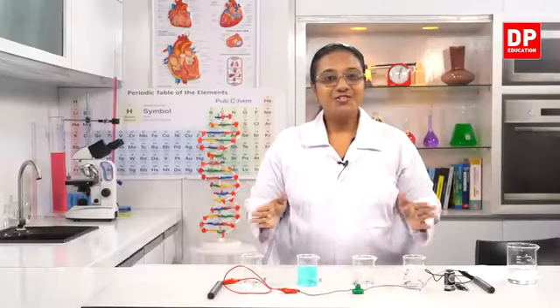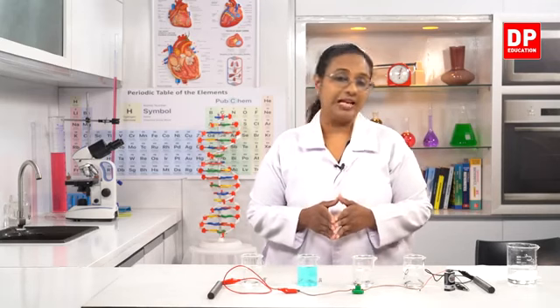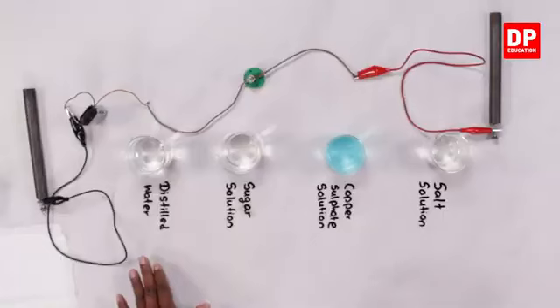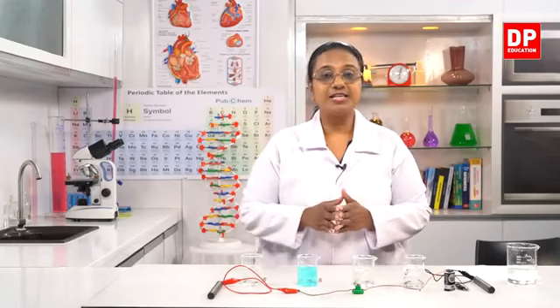Okay, students. So now we are going to do this activity to observe the properties of ionic compounds and covalent compounds. So here I have 4 different solutions: distilled water, sugar solution, copper sulfate and salt solution. So what we need to do is we have to have the circuit connected.